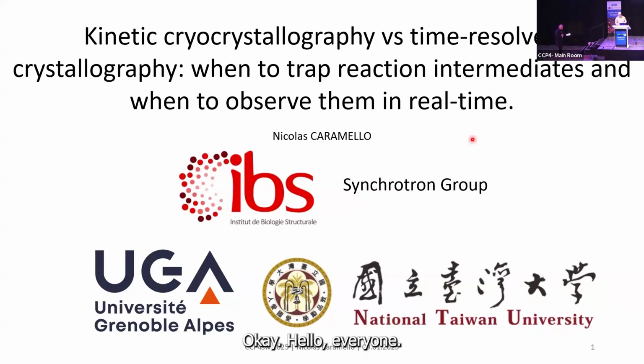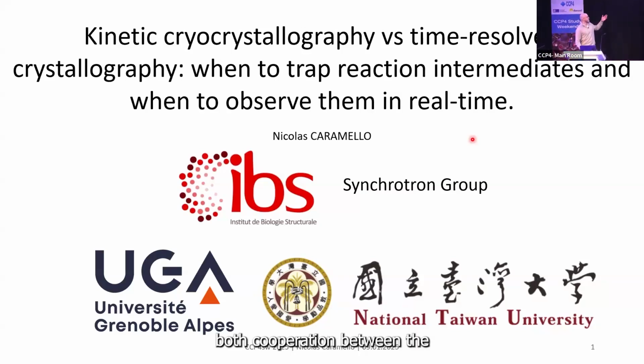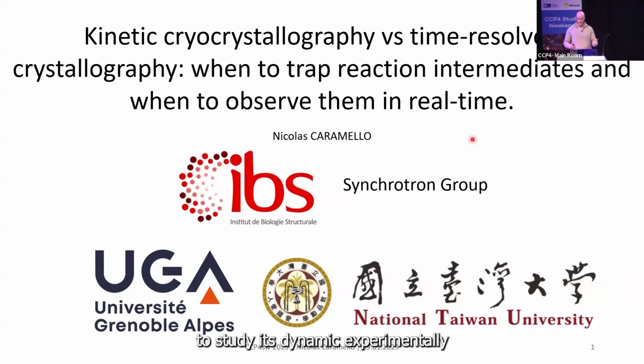Hello, everyone. So I'm Nicolas. I'm a recent postdoc at the IBS in Grenoble in the synchrotron group. And my project involves cooperation between the University of Grenoble and the National University of Taiwan. And in keeping with the title of the session, I'll be explaining how you can characterize your sample out of its resting state to study its dynamic experimentally with time-resolved crystallography and other methods.